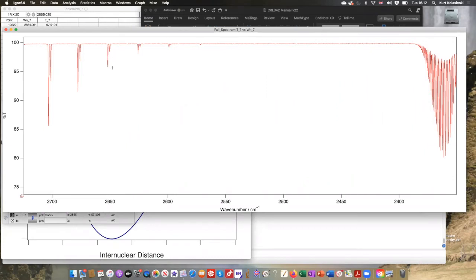All right, so that's where this is coming from. One is the more abundant isotope, right? The Cl35, and the other one is the Cl37, the less abundant isotope. So you can tell the difference between these two isotopes of HCl, and that's what's causing this doublet structure, right?